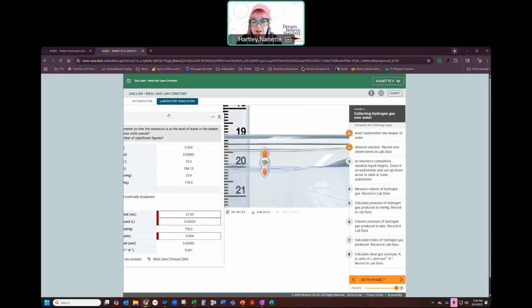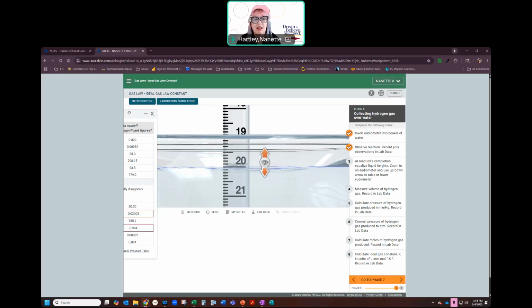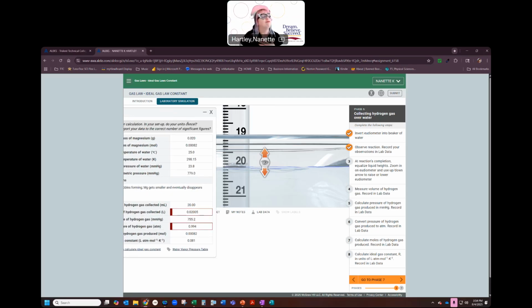And what am I doing here? I'm literally trying to guess as to what it thinks that number is. Is that reasonable? I don't feel that is reasonable. I don't feel good about this. But again, it's a limitation of what we can see in this virtual environment. I will tell you that the virtual environment is much, much easier than actually physically doing this, because it's a horrendous process to get all of this physically set up. But there is a limitation in how you can see this.